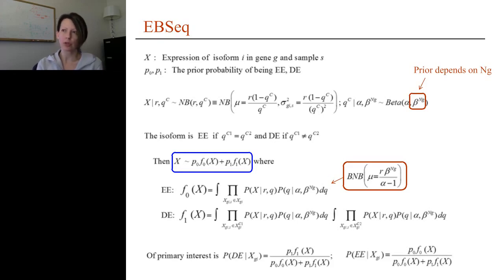Lots of approaches say they naturally extend to multiple conditions, but if an approach is t-test based, or something like a t-test, when you get into multiple groups you move into something like ANOVA. Although in that case you can identify genes that have some change, it's more difficult to figure out where the change actually is. Whereas in the mixture model-based approach, you have a specific posterior probability that quantifies the places that may be different. For this specific isoform or this specific gene, the first condition looks different from the other 2 conditions, and those other 2 conditions look similar. We can actually quantify those possibilities.